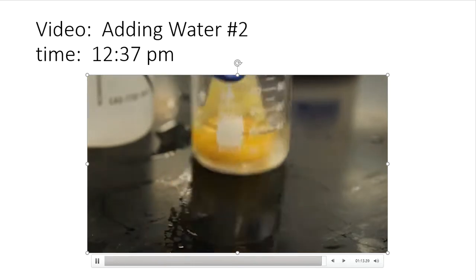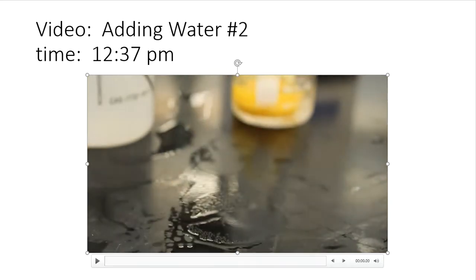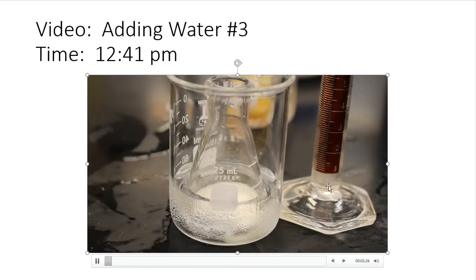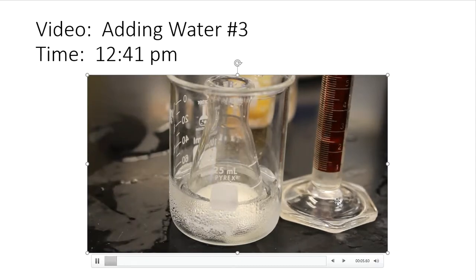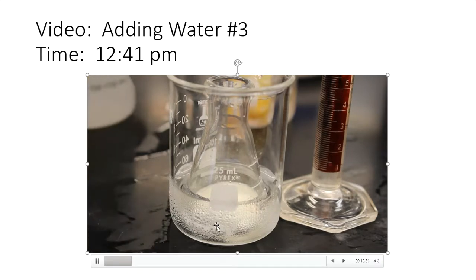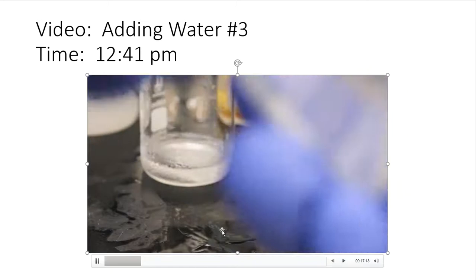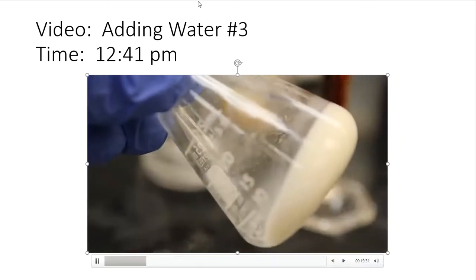All right, so in the bath it goes. We need to let it sit for a few more minutes. And then I'm going to go on to component number 3, which is our third lab together. And this is methyl benzoate. So I'm going to add water to the methyl benzoate. This happened at 12:41 p.m. in the afternoon. Once again, there's my graduated cylinder. I need 10 mils of water. We're going to take it out of this ice bath together and add water to that reagent. Make observations. It'll probably show up on the data sheet. I sound like a broken record.